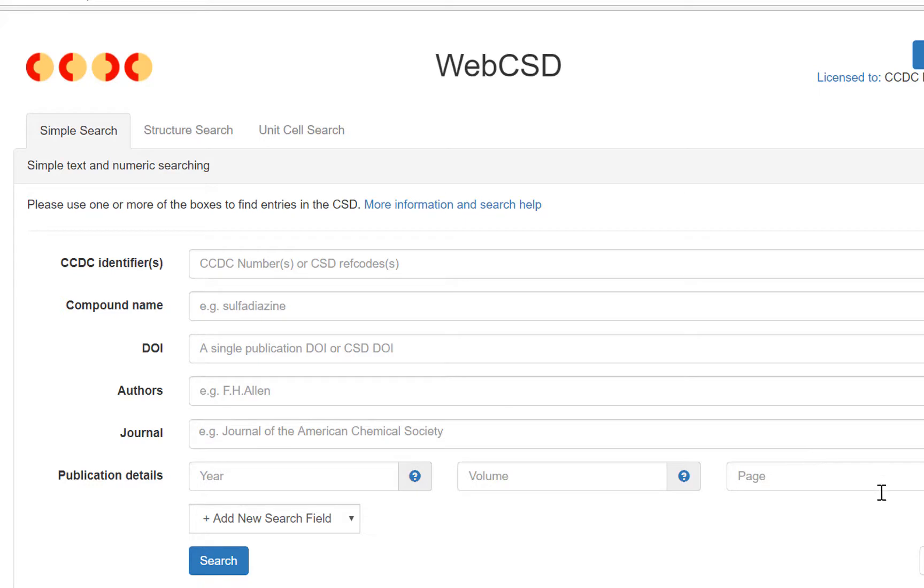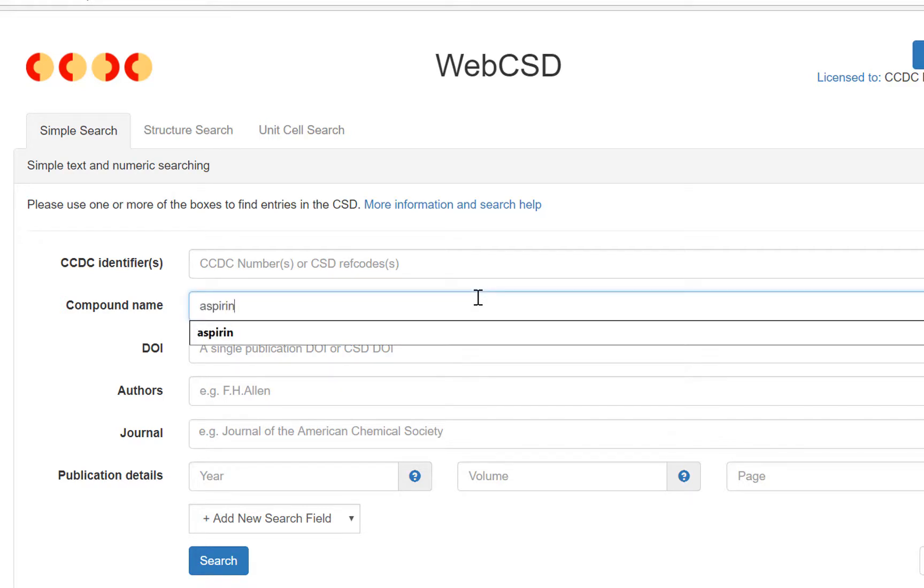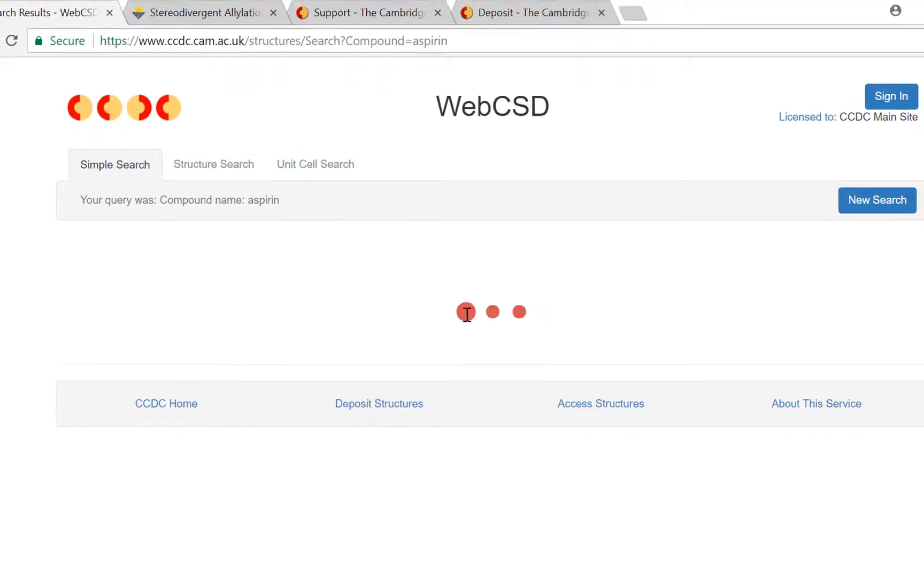So here's our search. I'm going to show you a simple text search for aspirin. Into the compound name box I'm going to type aspirin and away we go.